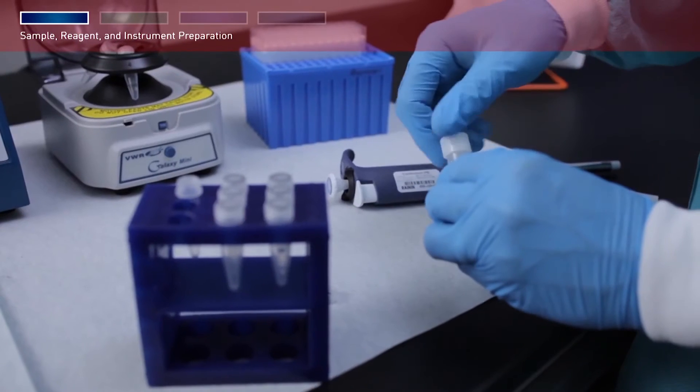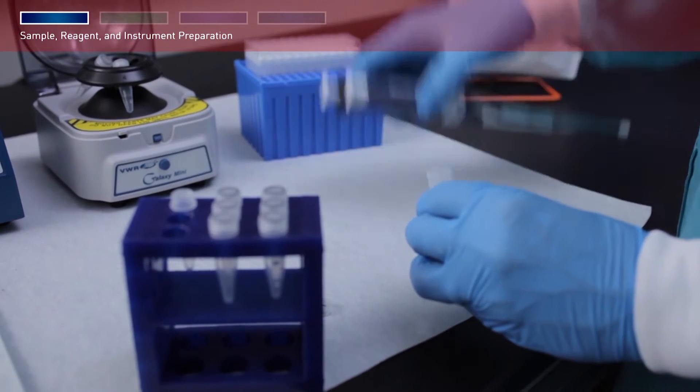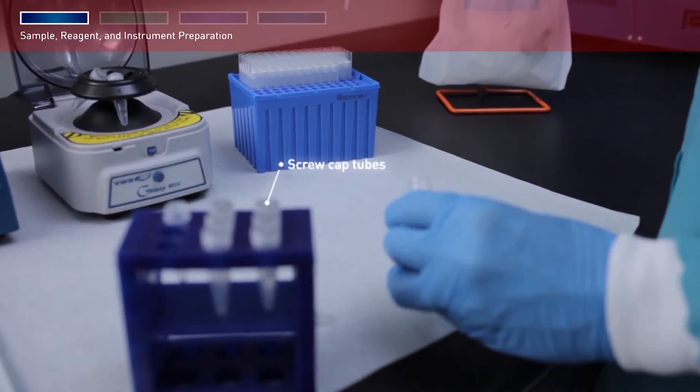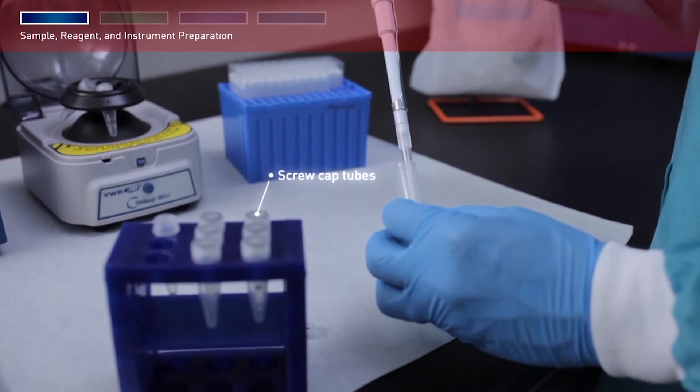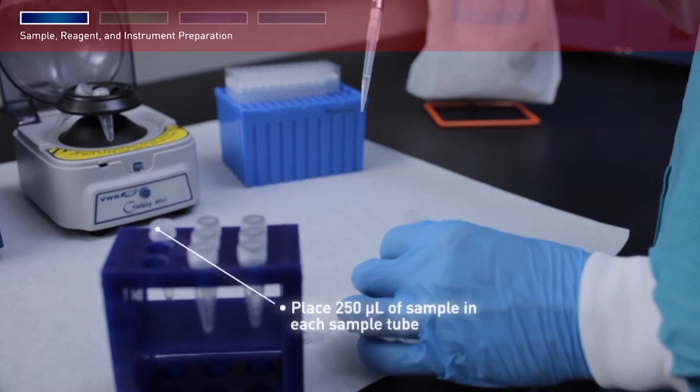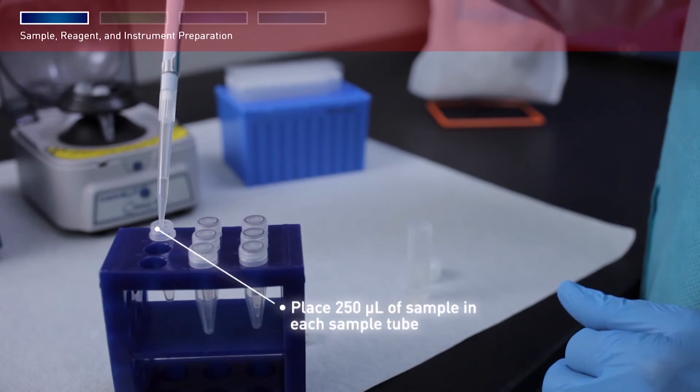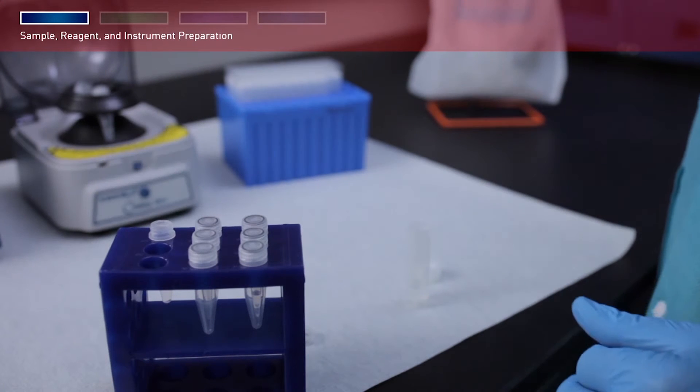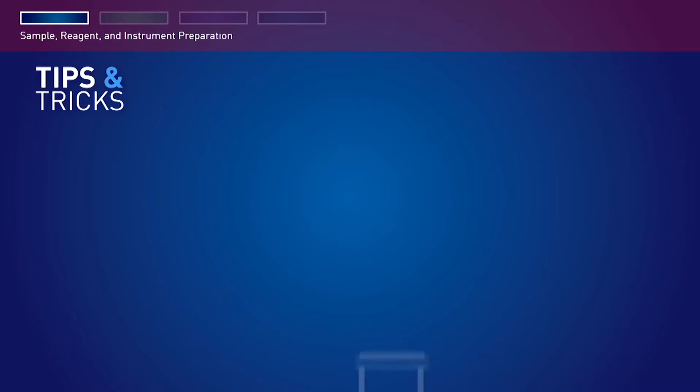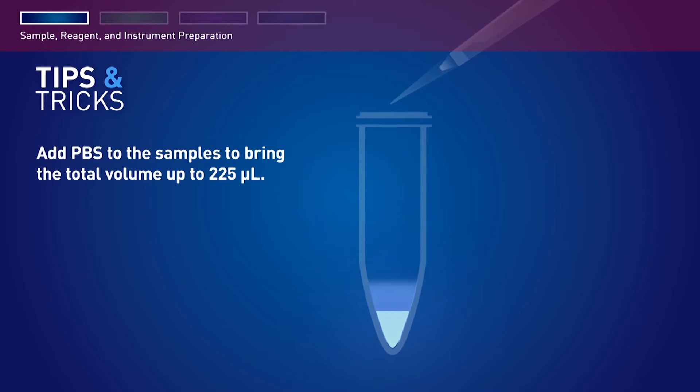After loading and inserting the cartridge rack and tip and tube rack, prepare samples in triplicate using screw cap tubes. Place 250 microliters of sample in each sample tube, up to 13 sample tubes in total. For samples that are less than 225 microliters, add PBS to the samples to bring the total volume up to 225 microliters.